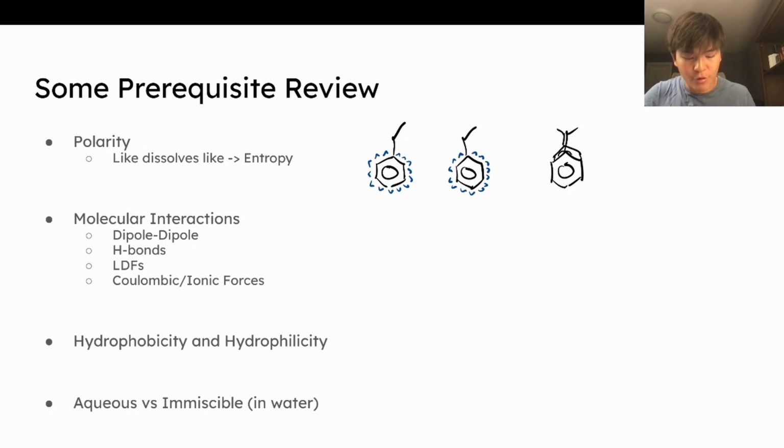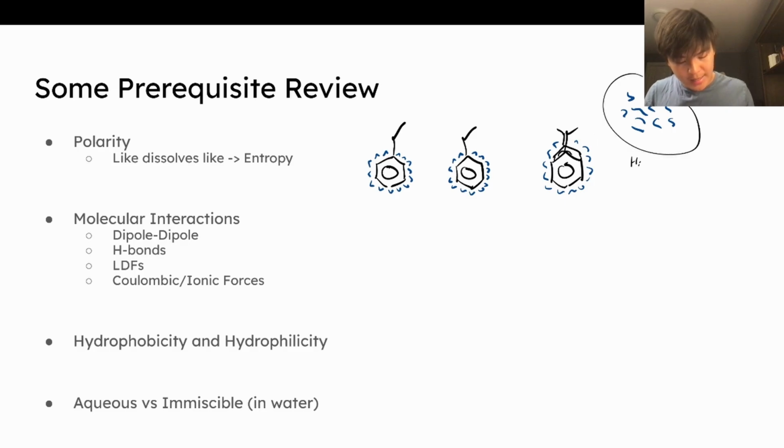Now, when these rings are overlapped on each other, obviously we still have our water. These guys are very, very ordered. But look at all the other water that we got rid of in between. Those guys are just floating around, and they can do whatever they want. These guys can arrange themselves in however many ways they want. And this is very disordered. High entropy.